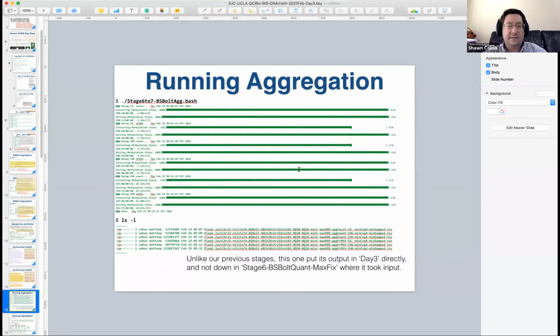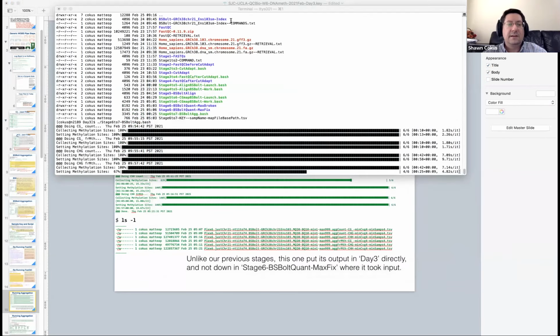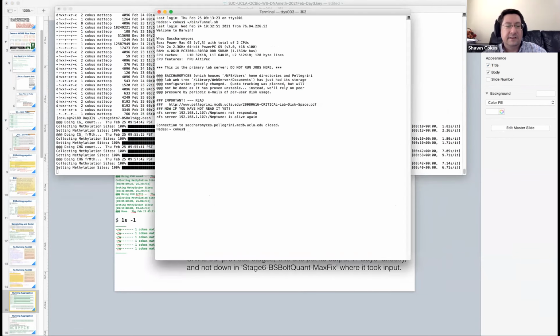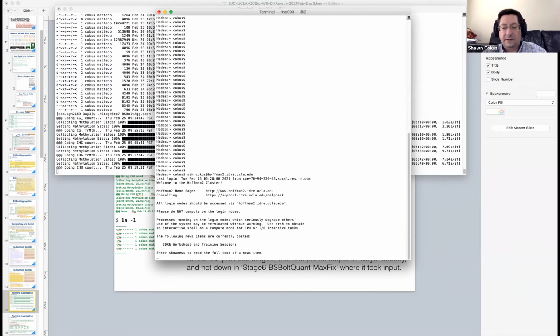Okay, so share screen, and we need terminals. Right. Okay, so now we've got this. Oops. Oh, crap. That's the one I shared, isn't it? So that was the wrong command.